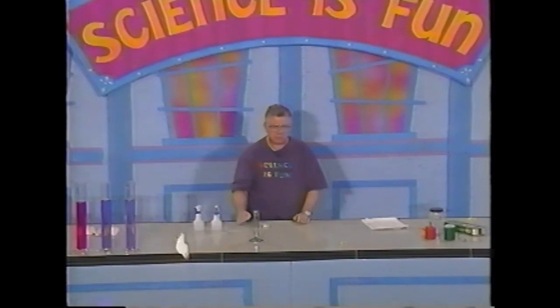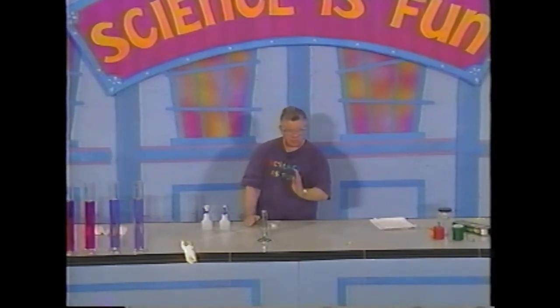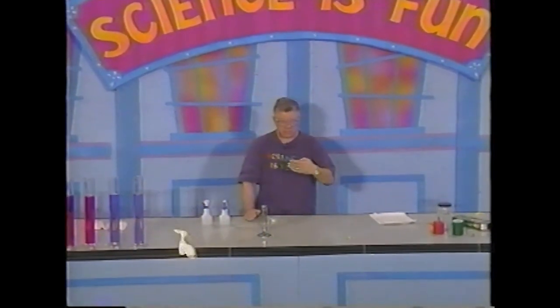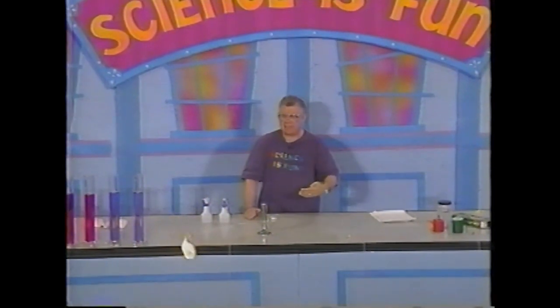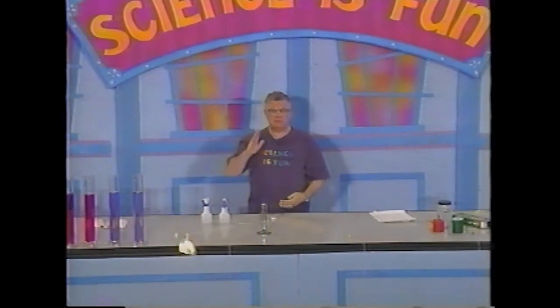What I'd like to ask you to do now is to look at the monitor and watch this very last reaction we did in slow motion. You won't hear any sound. There is the explosion. You see that big ball of fire? All right, now, we have done now 4 balloons, and you are very observant. You must have observed that in addition to sound energy that's being given off, the loudness of the chemical reaction is getting greater.